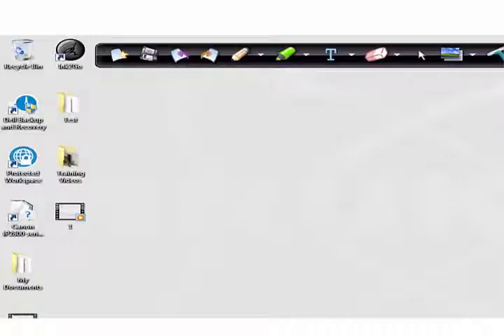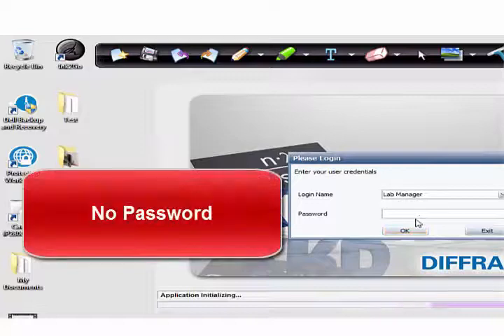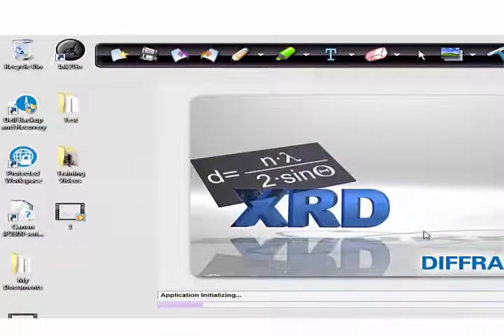When it's ready, the icon will play on the taskbar and the shortcut is ready there. For this new system, there will be no more Diffract Commander or Diffract Wizard as separate programs — these two programs are integrated into a program called DiffractSuite Measurement. You log in as the Lab Manager — there's no password by default, but if needed we can set it and configure different levels of login profiles. I'll log in as Lab Manager and click OK. It does some initialization which takes some time.